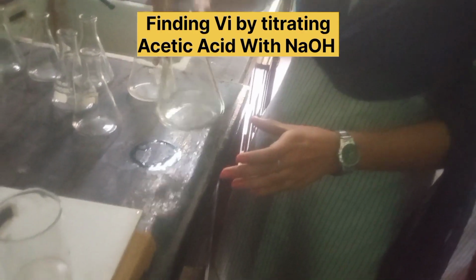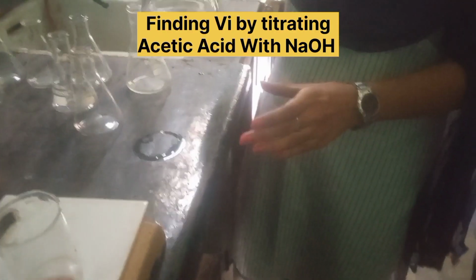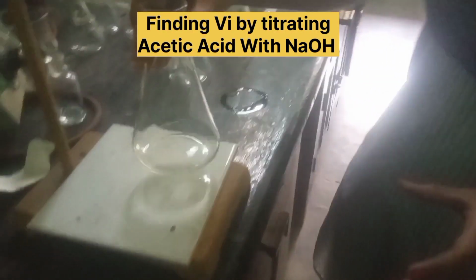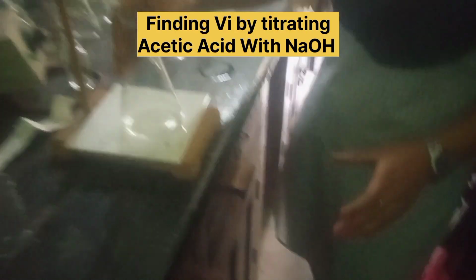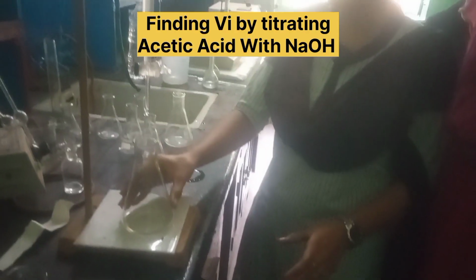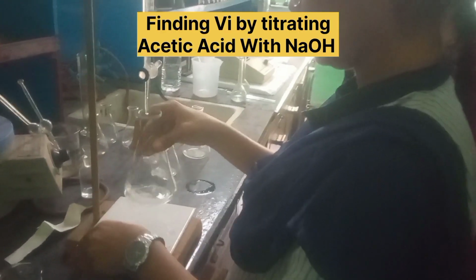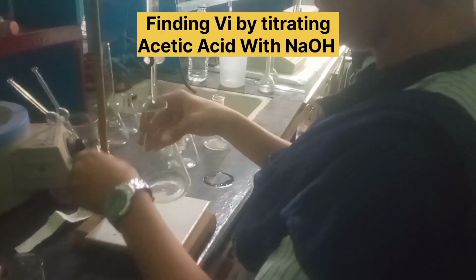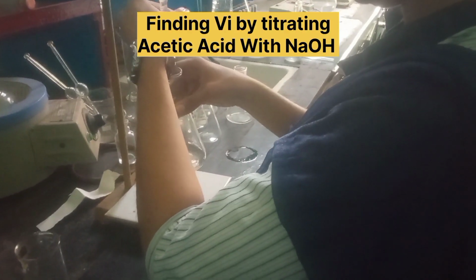So here let us see how we have to do the titration. After taking pure acetic acid solution in conical flask, it is added with the phenolphthalein indicator and titrated with 0.1 M NaOH taken in burette.